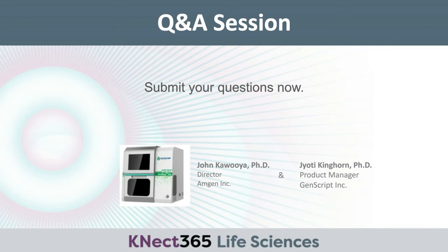All right, great. So the next question we have here: I know that 18 to 24 hours doesn't hurt viability or quality, but do you need that much time for full recovery? And what recovery would you see at 1, 2, 4, 6, 16 hours, etc.? Also, three-parter here, what brand of beads were used for the quality validation studies?